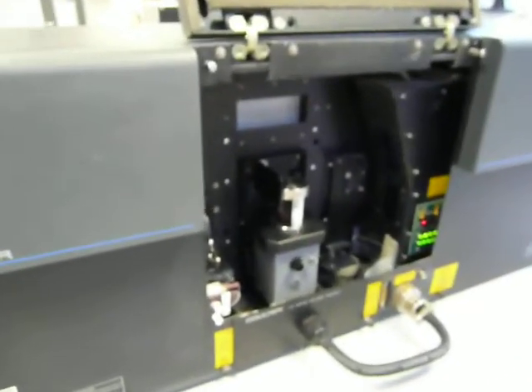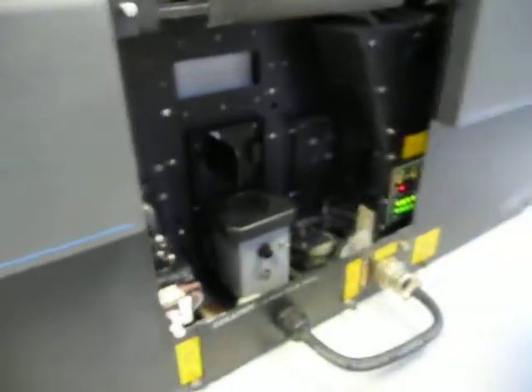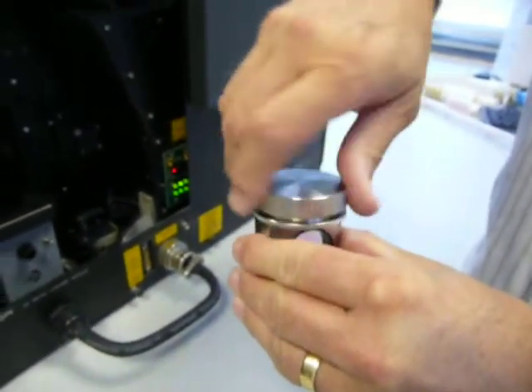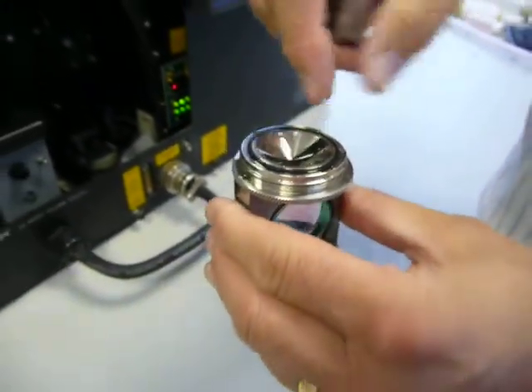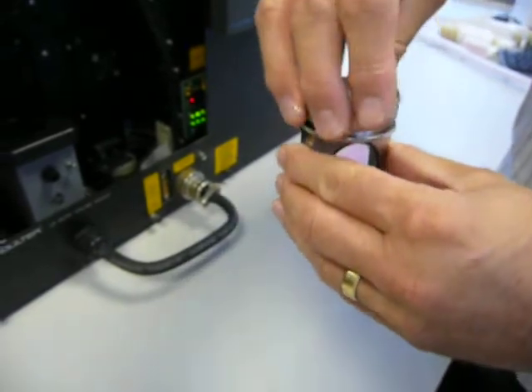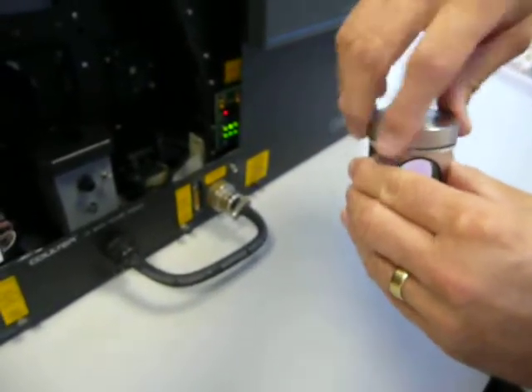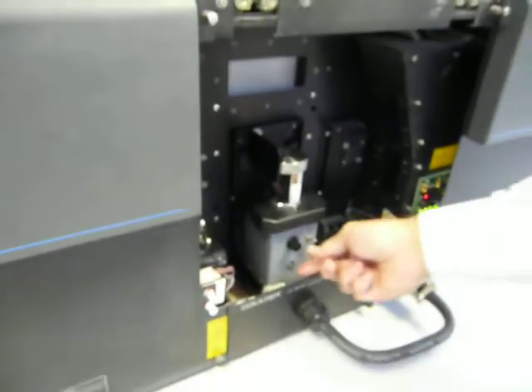Okay. So what do we do next to run a sample? Having put the sample in, you can use any liquid, including water and sunflower oil. The liquid fills the cell up, you put your sample into there, screw the lid down, pop it in there, adjust the stirrer, and shut the lid.